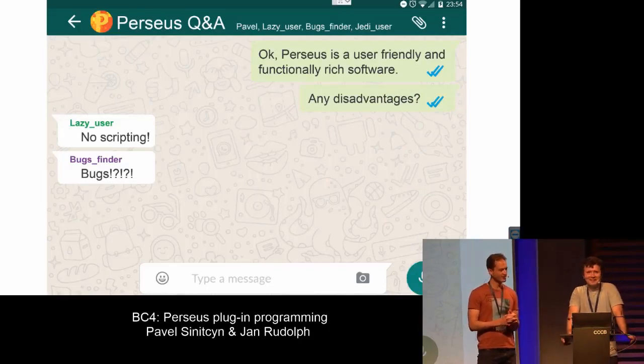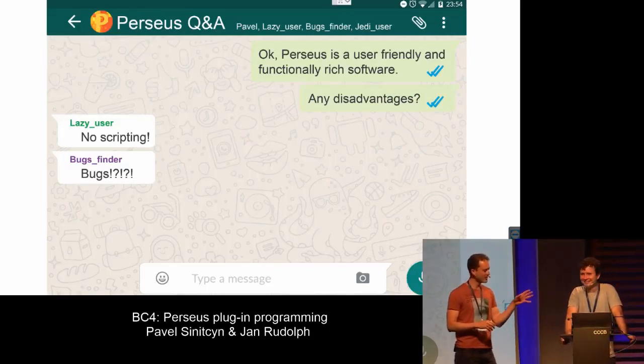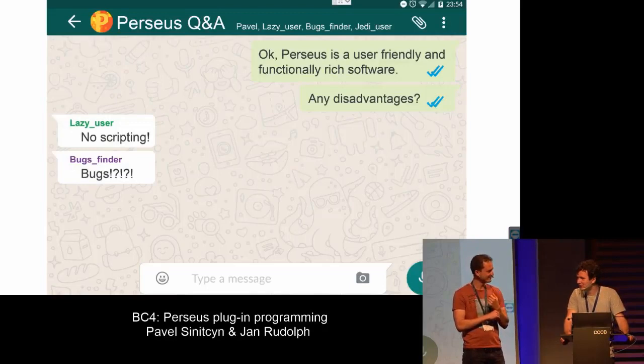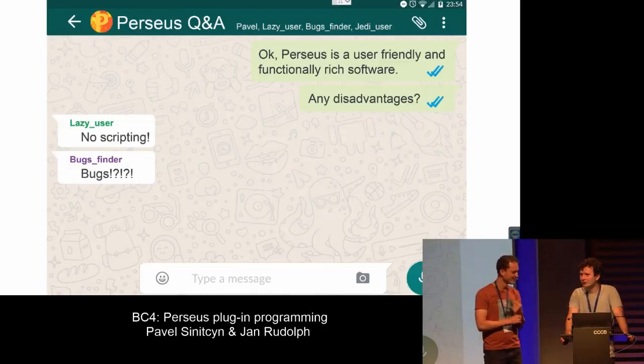I was really interested in solving this, but there are some really hard problems here. For example, what happens when the column names are not the same? So the scripting is hard. But at least I can say one thing: in previous years we said it's our to-do list, and now we can say it's our doing list.